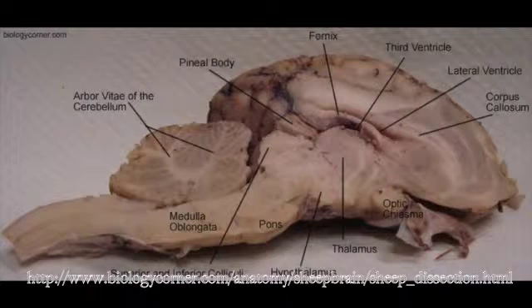The hypothalamus is located below the thalamus and composes the base of the diencephalon, or the inner brain. It helps regulate the pituitary gland and various other vital functions, such as maintaining body temperature, water balance, and metabolism. The hypothalamus is part of the limbic system, or emotional visceral region of the brain, which helps to control various impulses and urges, such as hunger, thirst, and sexual desire.